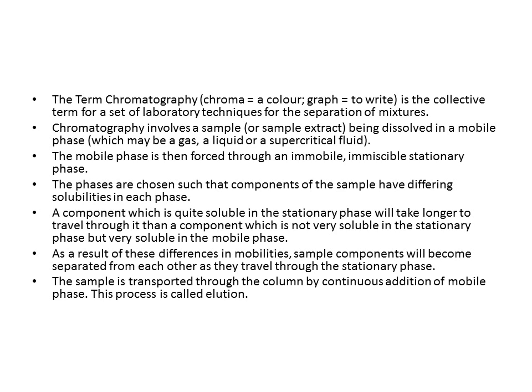The term chromatography, chroma, a color, graph, to write, is the collective term for a set of laboratory techniques for the separation of mixtures. And chromatography involves a sample or a sample extract which is being dissolved in a mobile phase. The mobile phase may be a gas, a liquid or supercritical fluid. The mobile phase is then forced through an immobile, immiscible stationary phase. The phases are chosen such that components of the sample have differing solubilities in each phase.